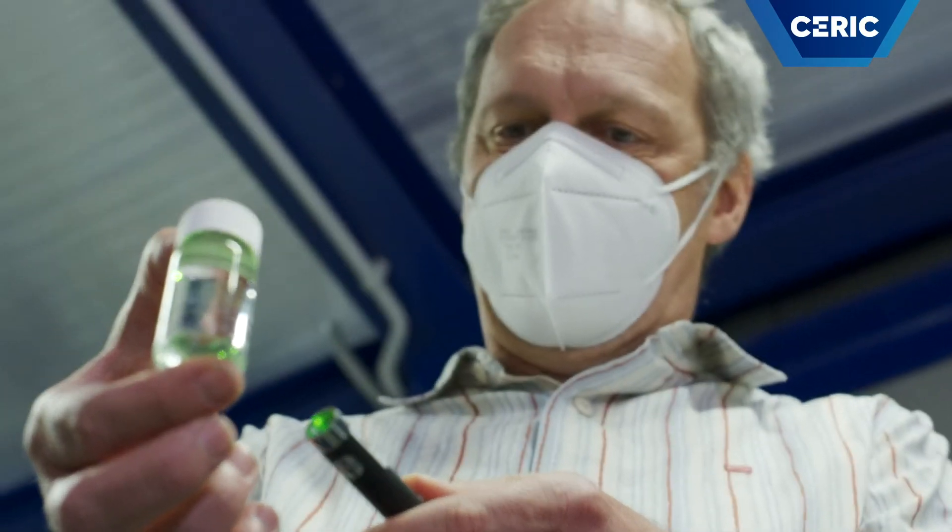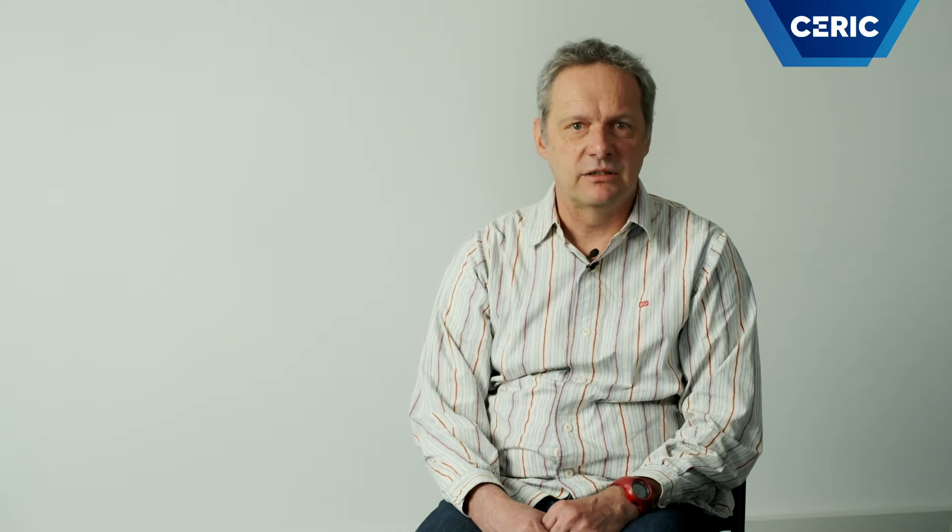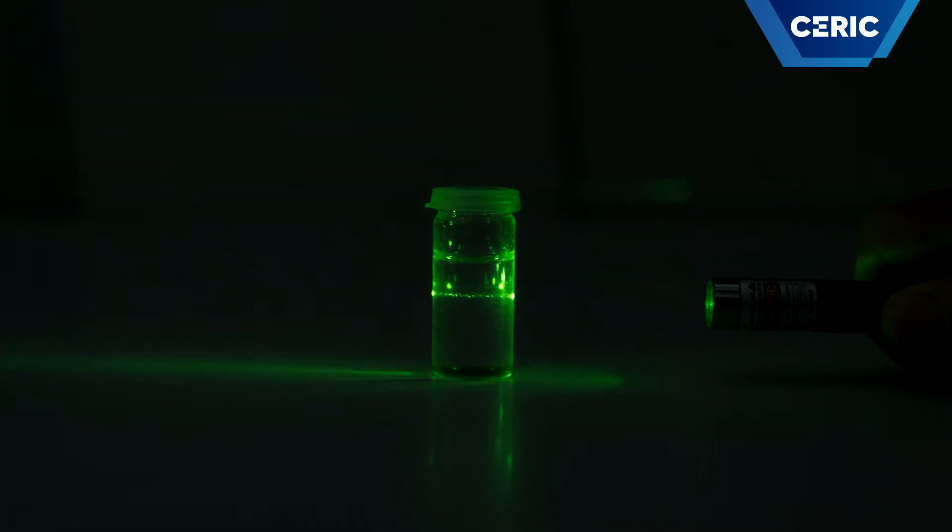If I shine with the laser through this liquid, what you observe is the laser beam inside the liquid. Structures with the dimensions of one hundredth of the diameter of a hair cause the light to scatter. This scattered light is what we measure.